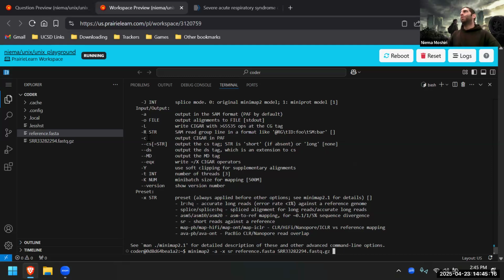In our case, though, I think someone asked to do variant calling. Most variant callers are going to need your reads to be sorted. So you do the read mapping, the reads in our sequencing experiment, the sequencer closed its eyes and just randomly grabbed reads from all over the genome. But for doing variant calling, typically these tools need them to be position sorted. After we've done the read mapping, we know exactly where each read hit. It's going to be some arbitrary order, and we typically want to sort them so that they're sorted by position. Yeah, go for it.